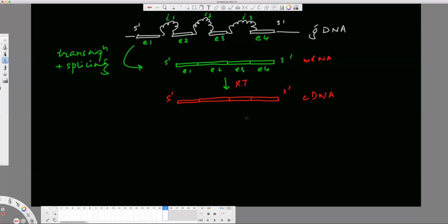Now the question is, you were supposed to do PCR of the cDNA to find out how many copies there were, which will indirectly tell you how much mRNA there was. So you need to select primers here. From where will you select the primers? Let us say that, as I mentioned earlier, a 100 base pair amplicon is sufficient to do expression profiling, and you find a good primer pair over here.